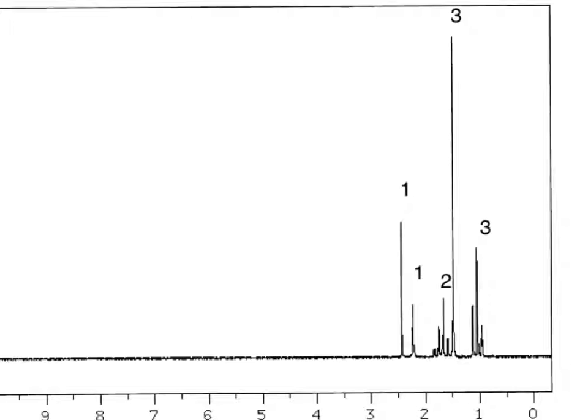And if we look at this, that's a triplet. And looking down here, we see there's a quartet. They go together. They're the only split peaks in the spectrum. So remember, if proton A splits proton B, then proton B splits proton A. So those two have to correspond to hydrogens that are on adjacent atoms in the structure.